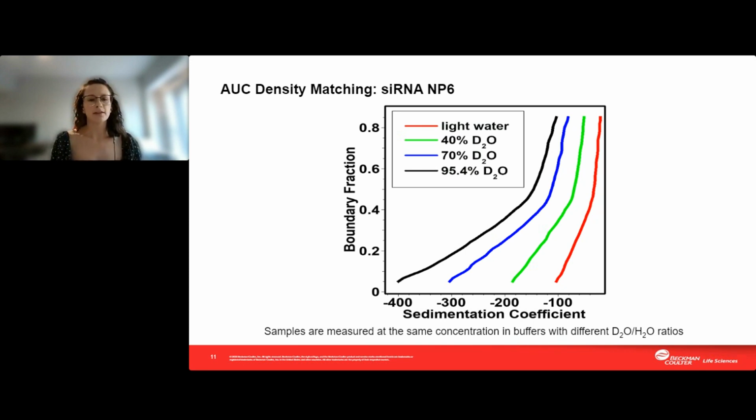The important thing that you want to do when you're doing this experiment is make sure that you're keeping the concentration of your sample the same throughout the 4 experiments that you're doing here. So we measured it at 4 different D2O H2O ratios.